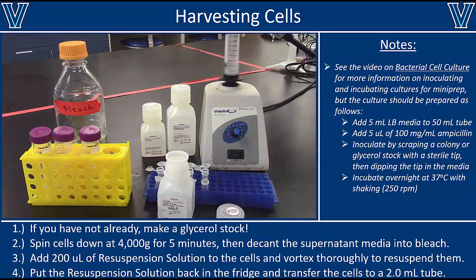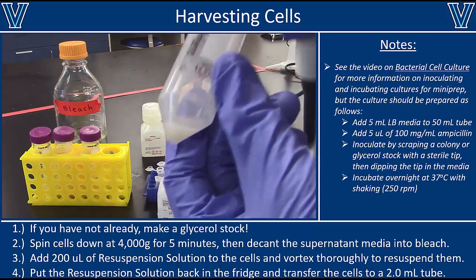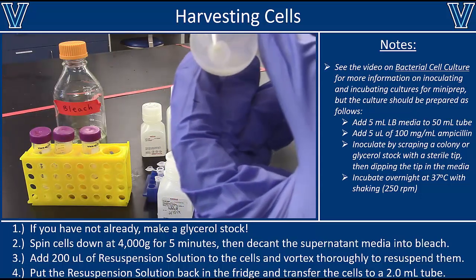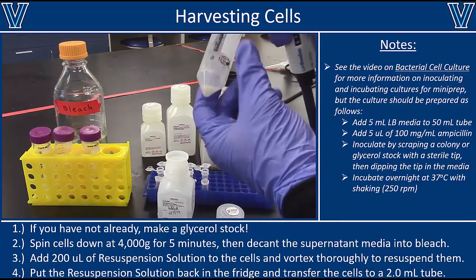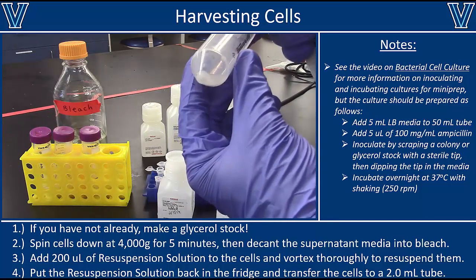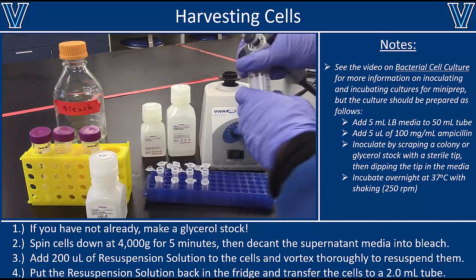Now, once you've added that, then you can vortex the tube thoroughly to resuspend all of your cells. Now, this is probably going to take 30 to 60 seconds, depending on the G-force you used, how many cells you have, but you want to vortex and then carefully check. You can see here I've still got a little bit of cell pellet at the bottom of the tube, and keep vortexing until all of your cells are resuspended. It's absolutely necessary that these cells are dispersed to get efficient lysis of the cells. And the more cells you lyse, the more plasmid you get.